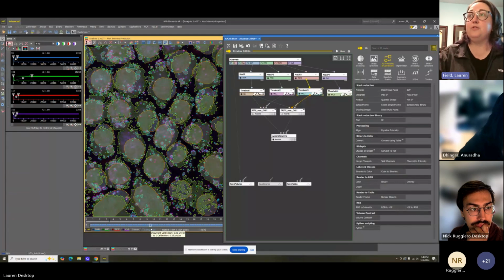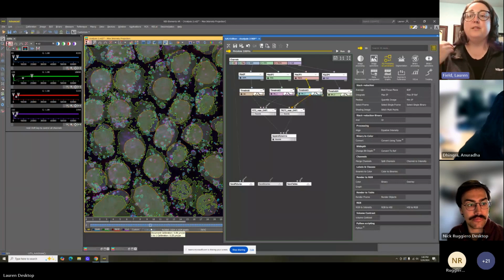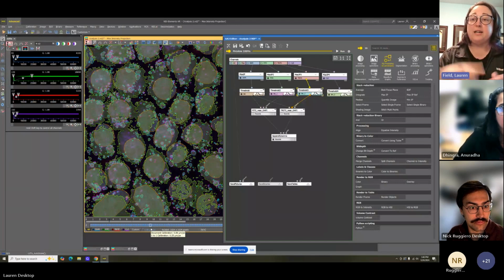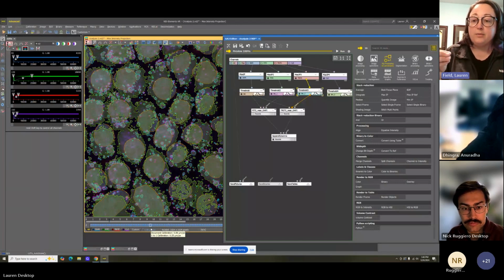So you can have routines that are incredibly simple, where you just hit a button, it does pre-processing, so you don't have to create a new image. You don't have to do this every time. You want it to create a max intensity, you want it to run a decon, and then you want it to do a very simple threshold. People build these types of GA3 routines all the time so that you hit one button and then it is done.